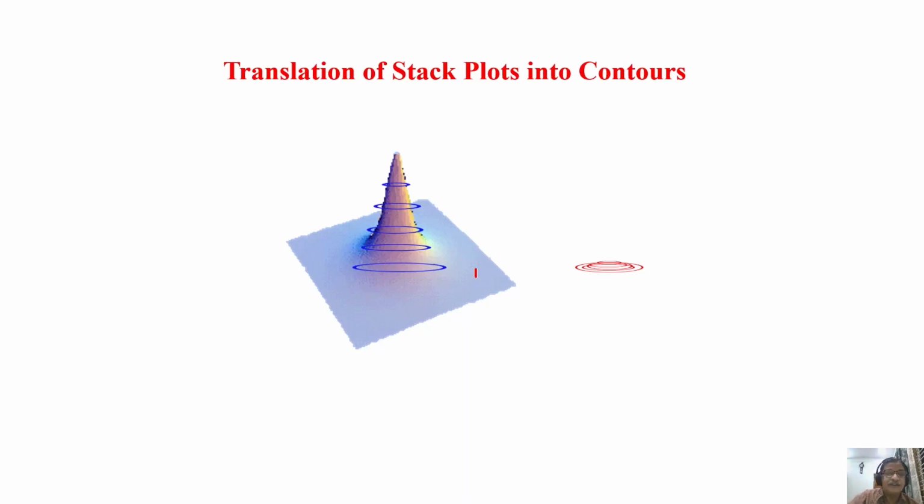So it is like the area of circles at different places. You understand? When I go on a circular path here, this is the area of a circular path, and each time what you get is translated into the contour like this.